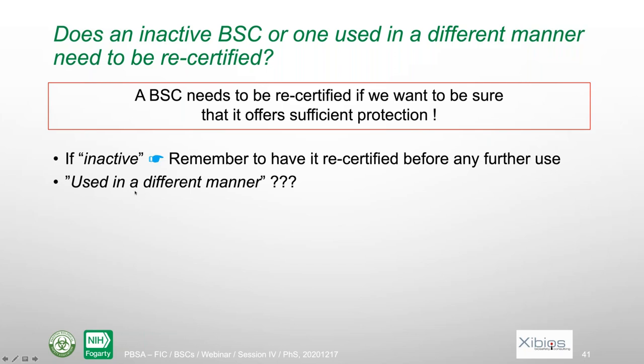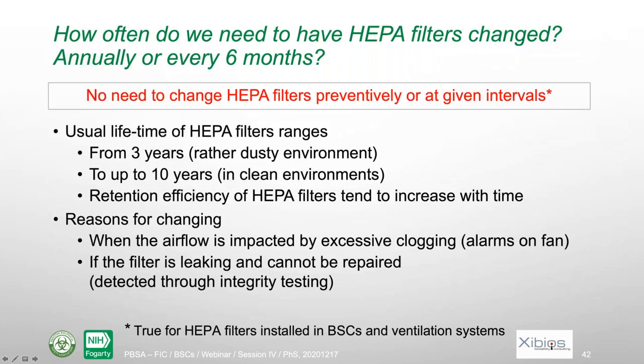But remember that if you don't use it and at some point you need to use it, in that case you really need to have it certified before use. It's even more true if it has not worked for quite a long time. So the filter might be blocked, there might be a number of issues there.